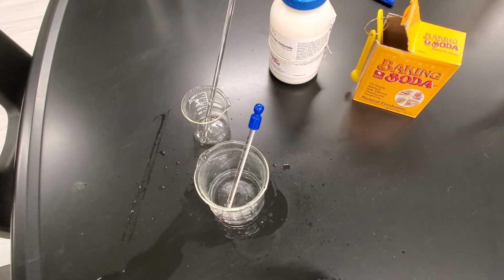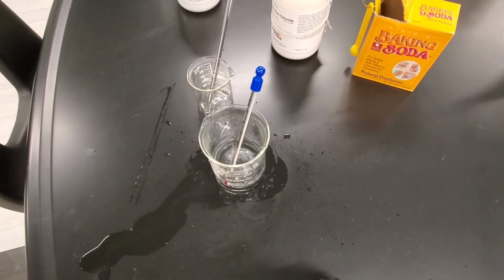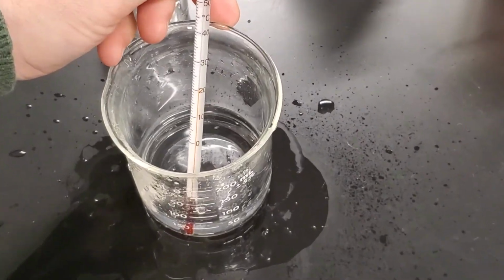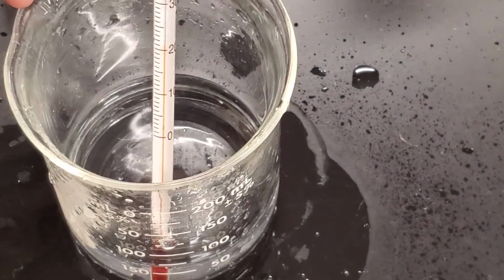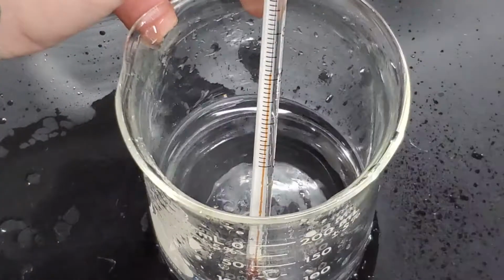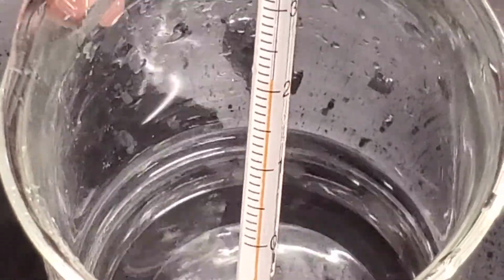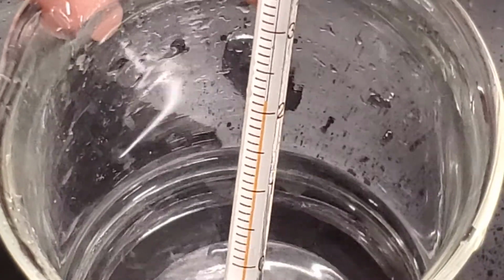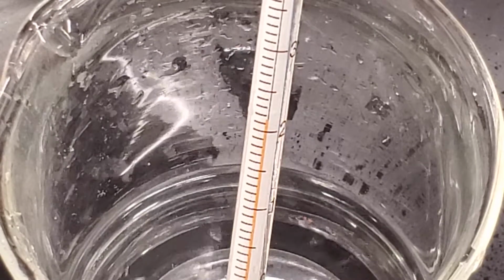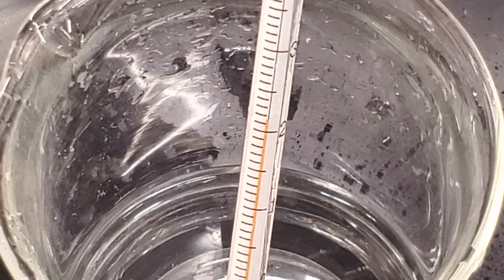So once I get this put up, we'll go ahead and zoom in on the current temperature. It should be pretty close to what it should be from rinsing it, and the amount of time that we've already spent waiting for it should slowly be climbing back to the correct beginning temperature. So again, we have our 20-degree mark there. We'll give it about another 30 seconds, and then we'll call it the official starting temperature. About 20 more seconds.